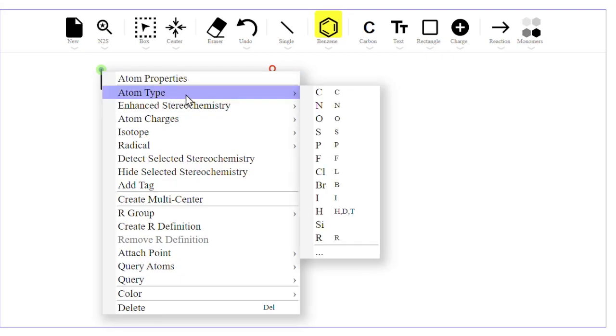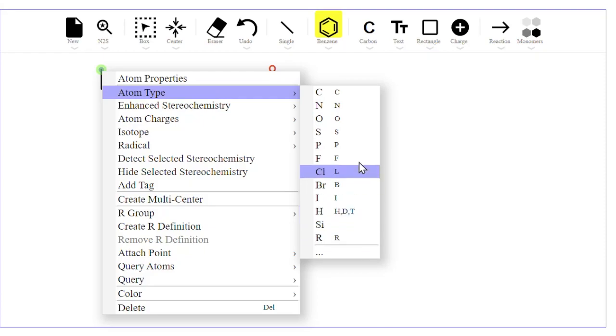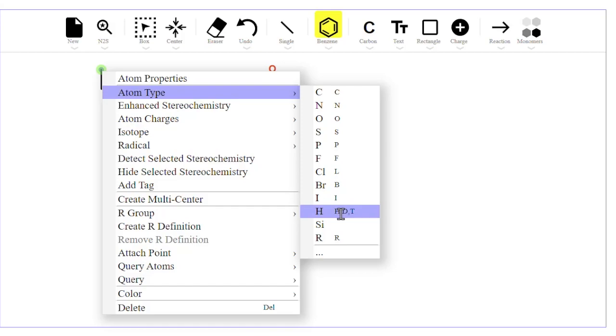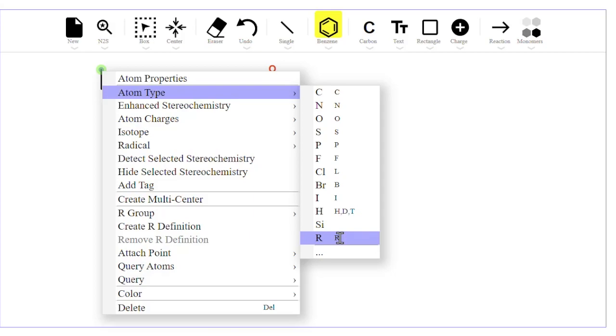Under atom type, you can see a list of atom types and next to them on the right are their keyboard shortcuts. For example, typing N gives you nitrogen, L gives chlorine, H gives hydrogen, D gives deuterium, T gives tritium, and R gives an R group.